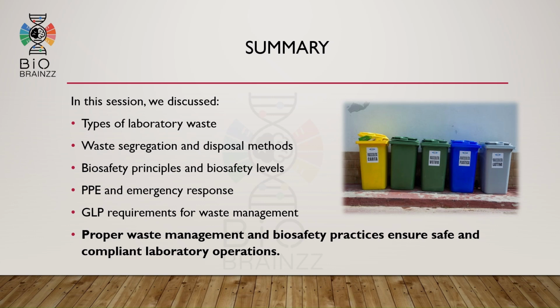To summarize the session, we discussed different types of laboratory waste, segregation methods, biosafety principles, biosafety levels, PPE usage, emergency response procedures, and GLP requirements for waste management. Proper waste management and biosafety practices ensure safe and compliant laboratory operations.